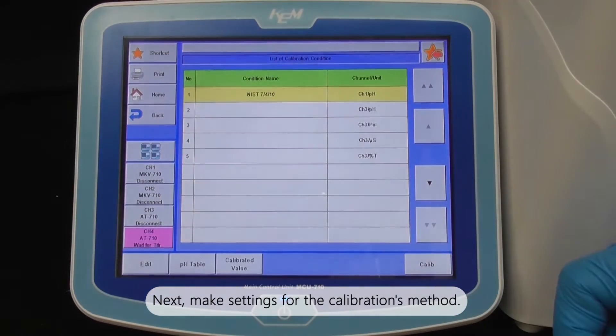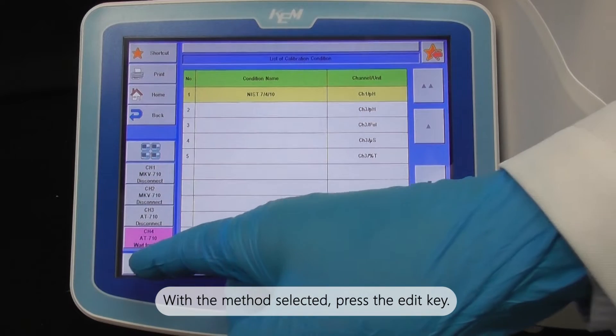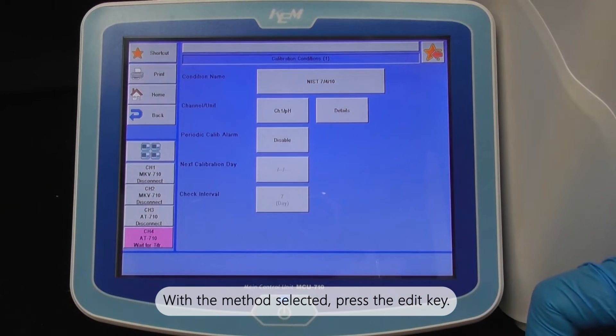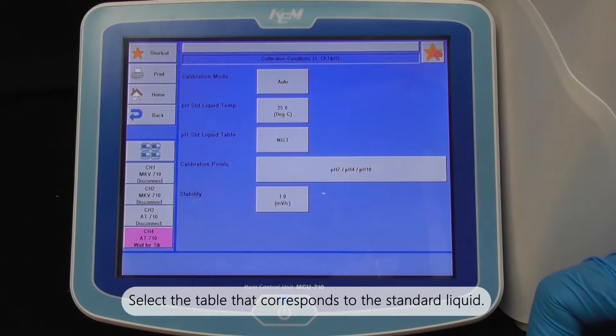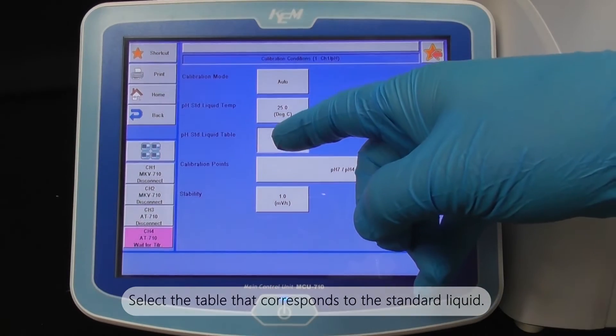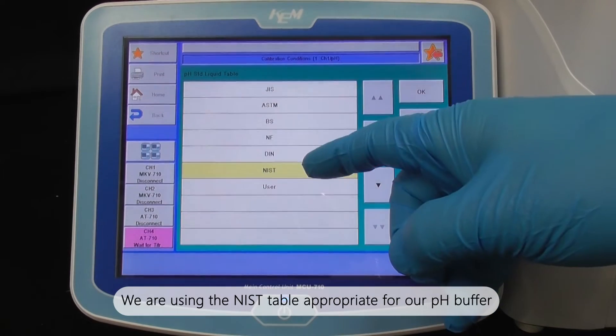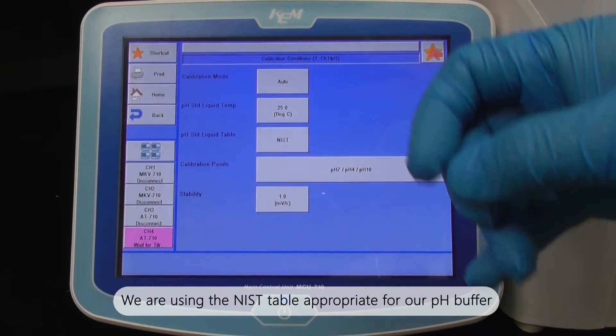Next, make settings for the calibration method. With the method selected, press the edit key. Select the table that corresponds to the standard liquid. We are using the NIST table appropriate for our pH buffer.